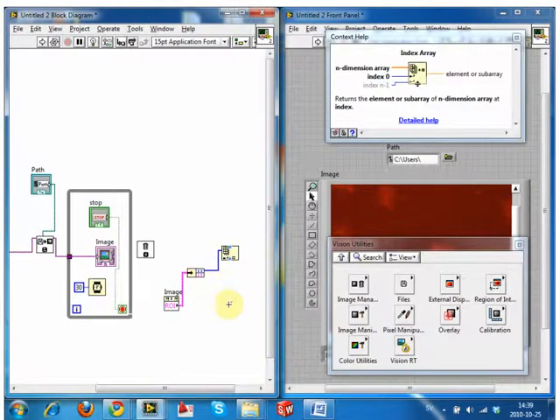And if you go to the help menu or look it up, you'll see that a global rectangle essentially contains the 2 corners, the top left and bottom right, are the only 2 coordinates that you need to actually construct a rectangle. You need 2 data points.